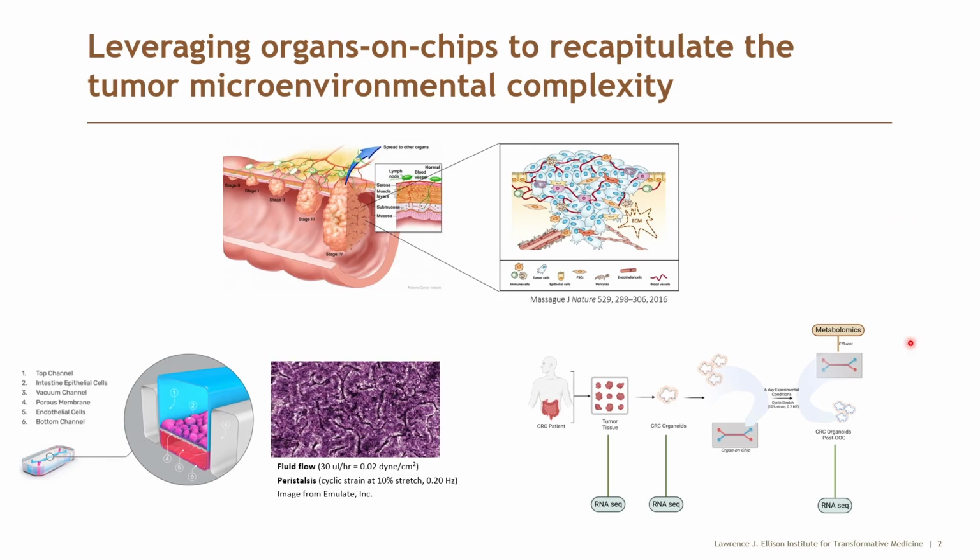In addition, this is a microfluidic system, so we will be collecting effluent across time points of this experiment to understand some of the metabolomics that's happening with these patient-derived colon cancer models.